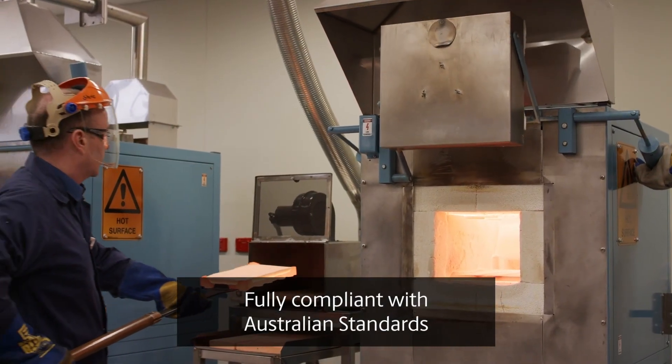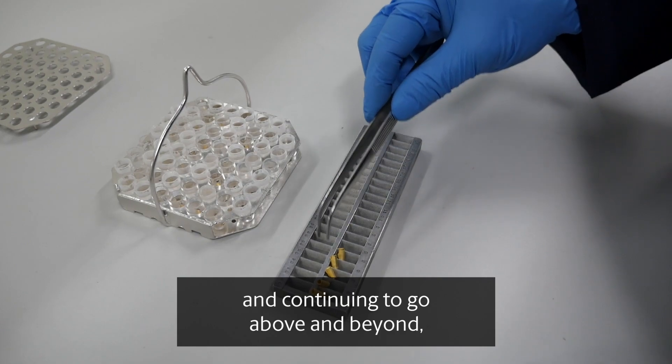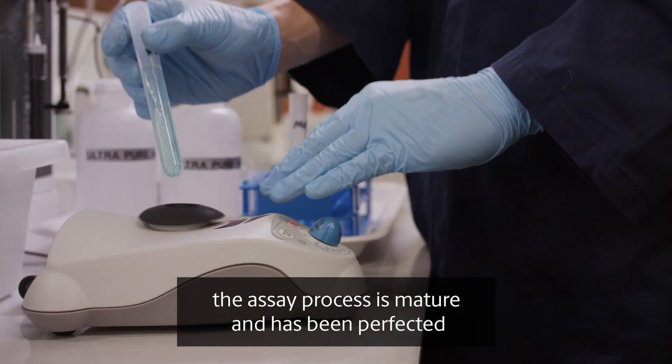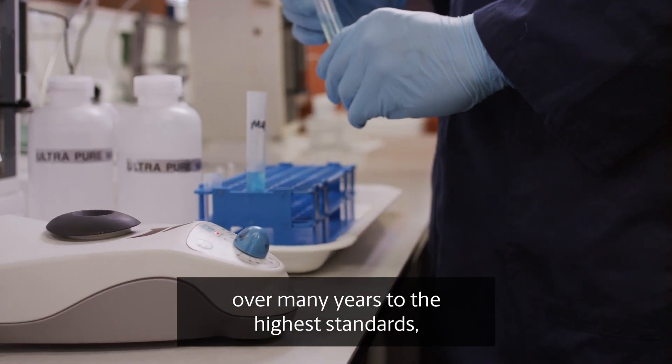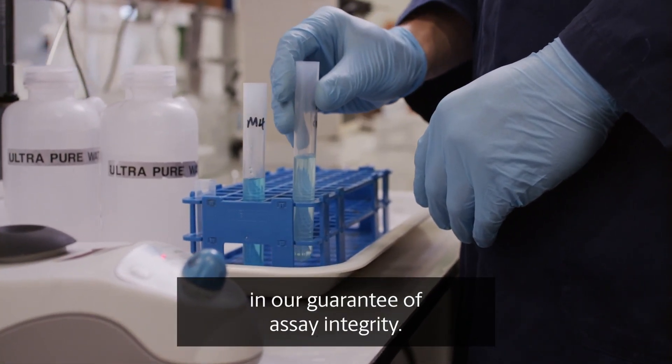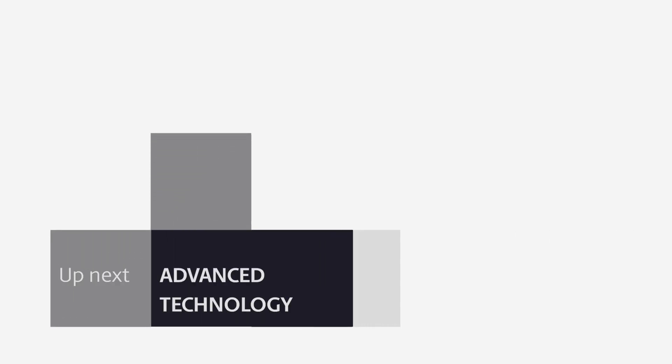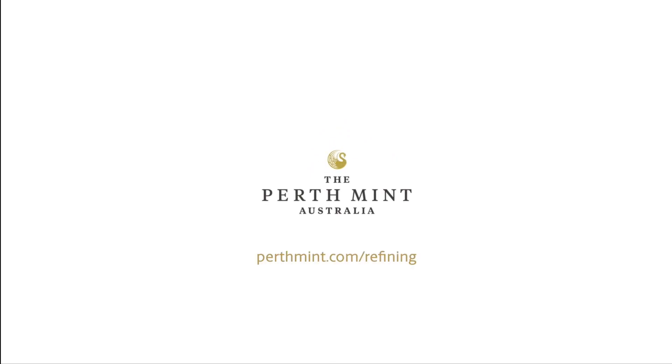Fully compliant with Australian standards and continuing to go above and beyond, the assay process is mature and has been perfected over many years to the highest standards, offering you complete trust in our guarantee of assay integrity.